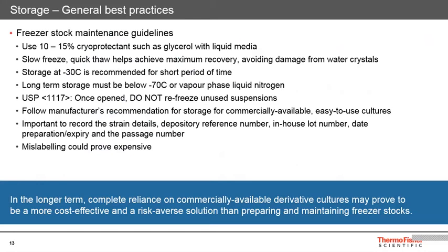Quite a few commercial producers like ourselves will ask you to avoid making frozen stocks. An important reason is that we have done a number of quality tests to ensure that the material works in your lab as a reference culture should. We have validated our production methods, and when you are making your own stock, there is often a lack of validation data.